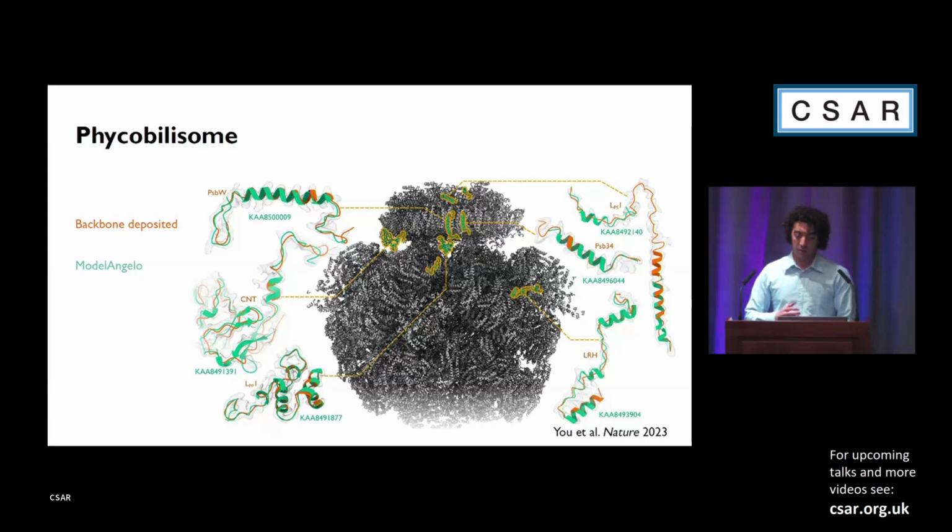But that's not the main part, because when they actually published this paper, they had 6 protein chains that they were still not able to identify, even after having spent months doing it, because they had identified the other protein chains. We were able to very easily resolve all of them to a high confidence. We told the authors, and they agreed with the identifications as well.